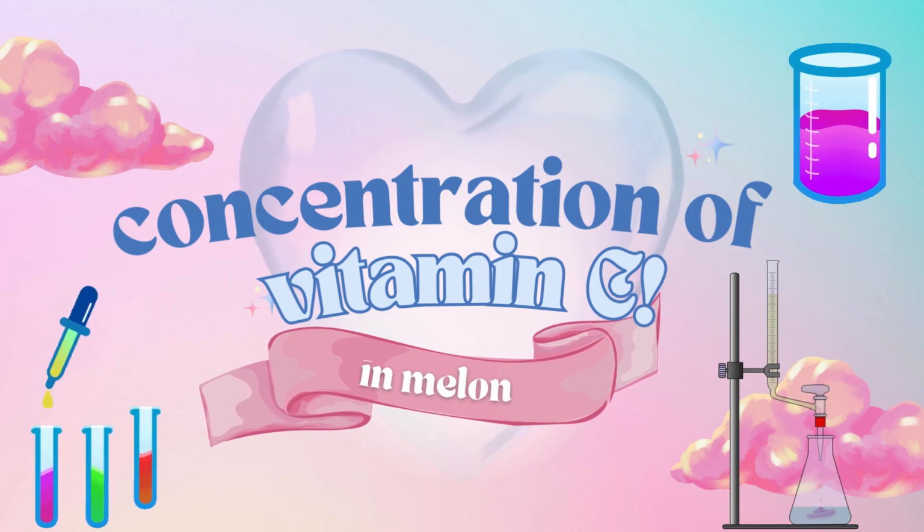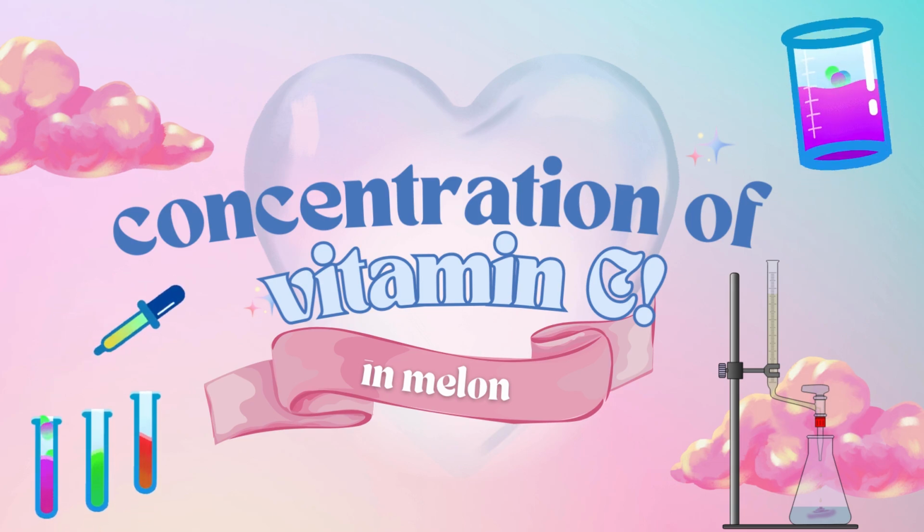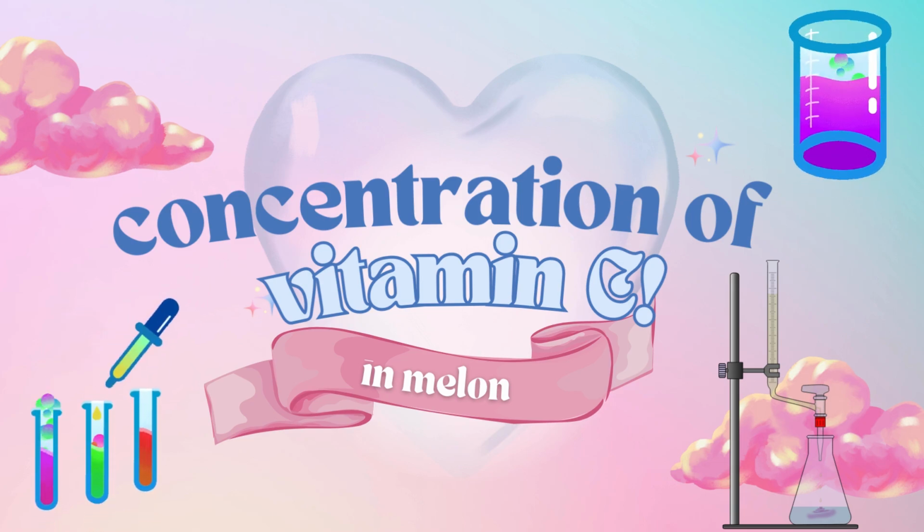I'm delighted to have the opportunity to share with you how to determine the concentration of vitamin C in melon using direct titration technique.